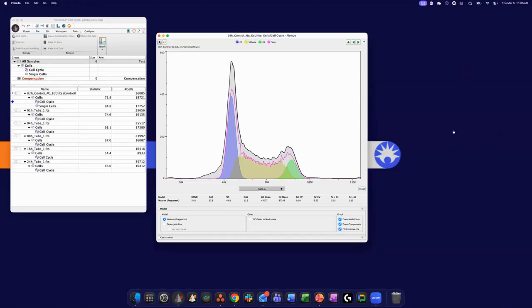Okay, since we can see events in the water buffered. I'm not sure, Haidao, if your question is if we need to acquire water on the machine before we acquire the samples. It's always a good idea to clean the machine before you acquire samples, so it wouldn't be a bad idea to just run water or buffer or PBS, whatever your SRL or core facility recommends for the cytometer. It wouldn't be a bad idea to run a little bit of a rinse or a cleanup before you put your sample on. Especially because DAPI stain can be very intense.